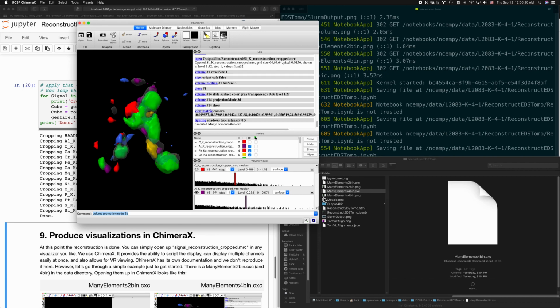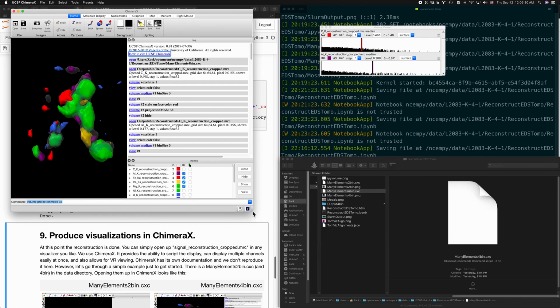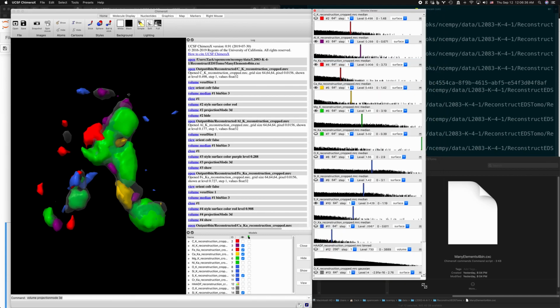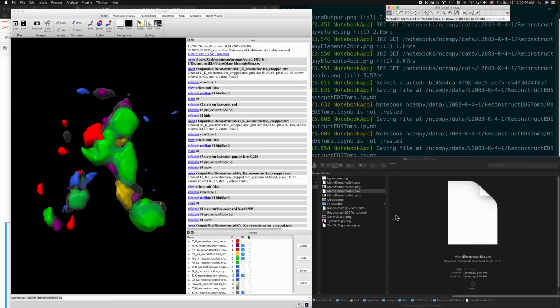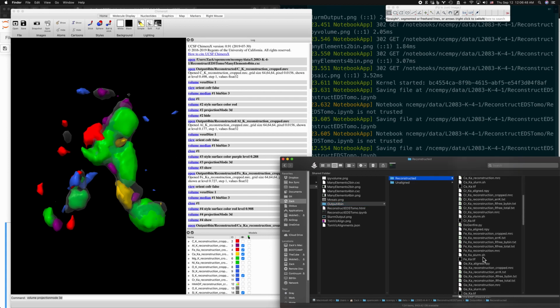Something which is very important is how do you set the thresholds for drawing these elements. So let me make this a little bigger. And then we're going to look here at the magnesium signal. In this case, I would prefer to start with the unreconstructed magnesium K signal.